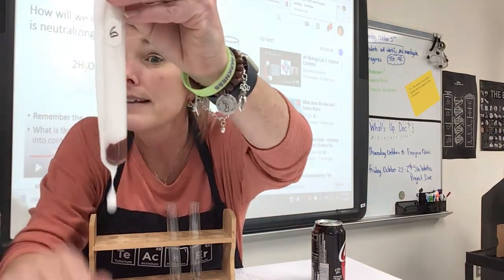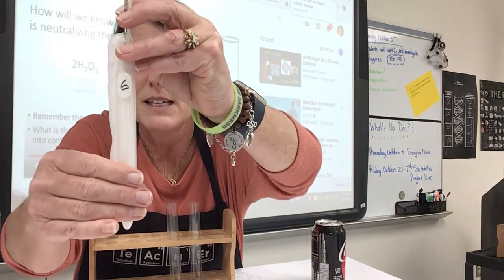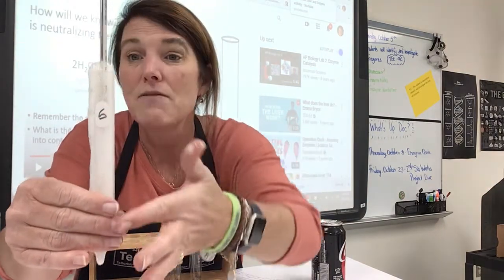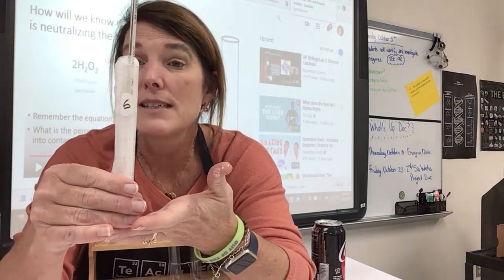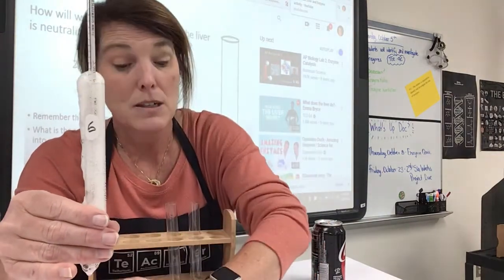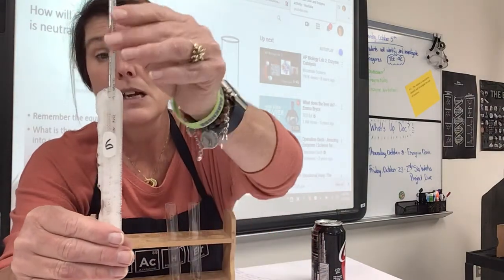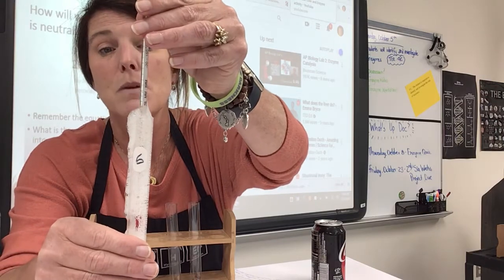Oh, I'd say that's a lot of bubbles. Oh, going over. Now you can't see this at home, but I feel it. I feel heat down here. Heat is exciting. We call that an exothermic reaction. But the thing is I can observe that and say I feel it, but to be a real scientist I need some data, which is why this thermometer.